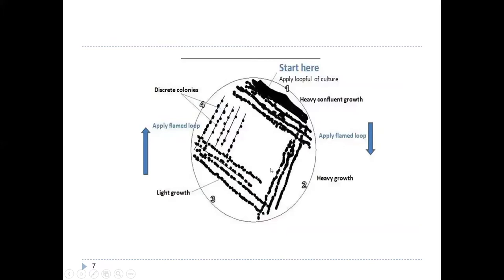This is the image of the four-quadrant streak plate method. You can see the first quadrant, second quadrant, third quadrant, and fourth quadrant. Here you can see there is heavy growth in the first quadrant and slowly the growth is decreasing, and in the end you get the isolated colonies.